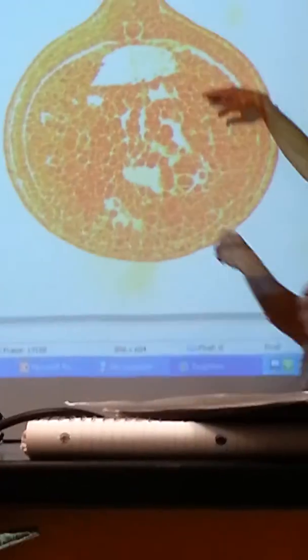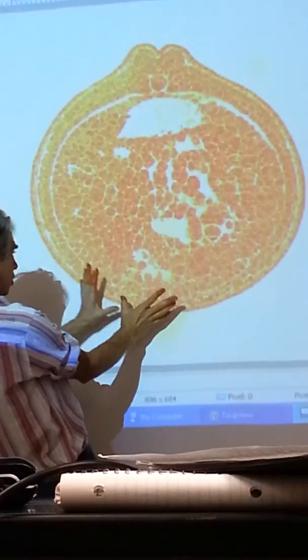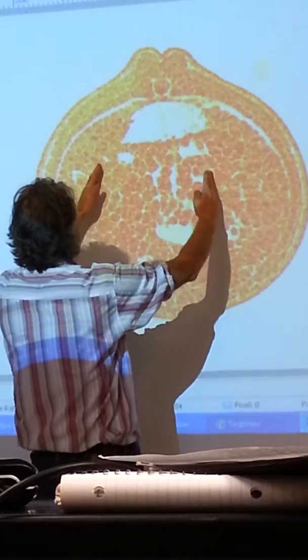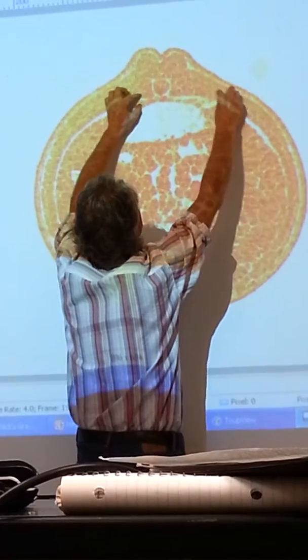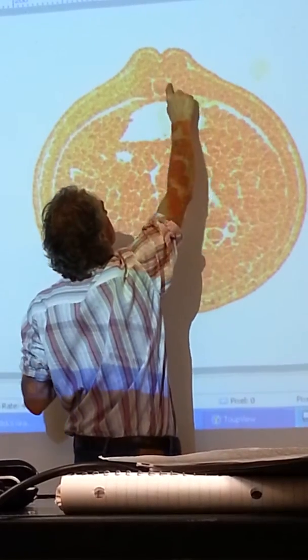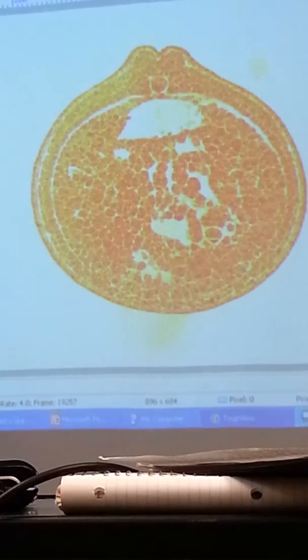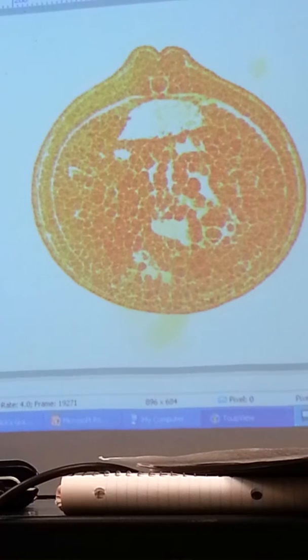Now what you're seeing here again is ectoderm. Let's come around. This isn't showing the yolk plug or the blastopore, but that endoderm has come up on the inside, and the mesoderm is a whole strip like this. Notice this little circle, perfect circle up there. Find a perfect circle if you can. Wave your hand.